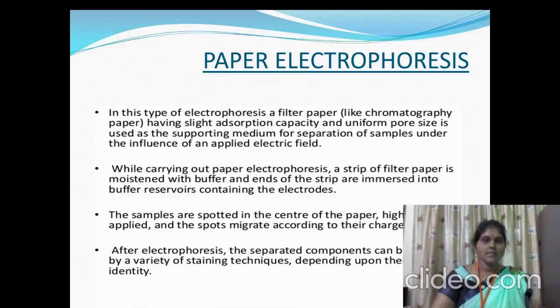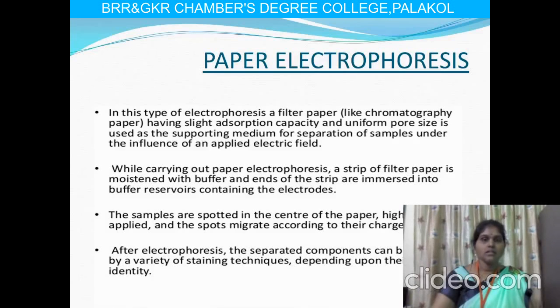Good morning, students. In the previous class, we discussed the migration of ions and the factors influencing electrophoretic mobility, and the classification of electrophoresis like zone electrophoresis and free electrophoresis. Now, I am going to discuss paper electrophoresis, which belongs to zone electrophoresis.